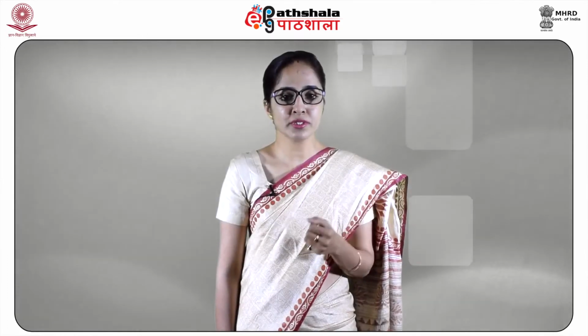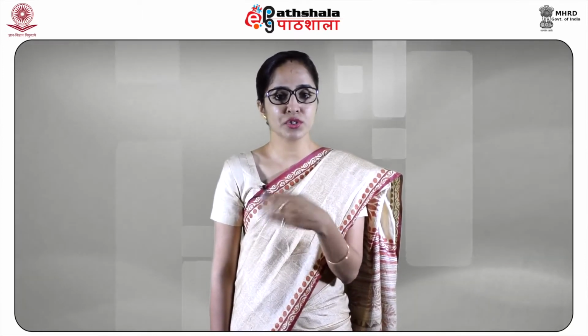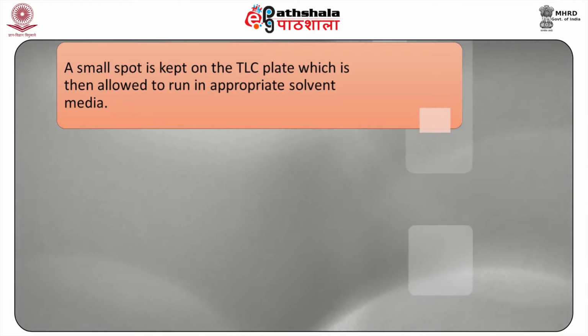Now, as you know students, TLC, that is thin layer chromatography, is a very simple technique and is commonly used for the qualitative analysis of the reaction mixture. Now, there are many organic compounds which absorb UV light of various wavelengths in the UV range. Now, this can be used for the determination of impurities in the organic compounds. A small spot is marked on the TLC plate, which is then allowed to run in the appropriate solvent media. By appropriate, I mean of appropriate polarity.